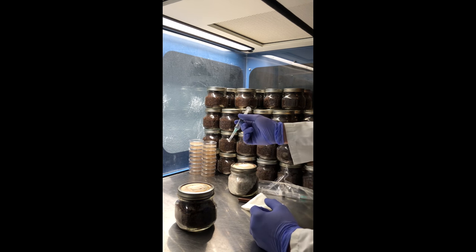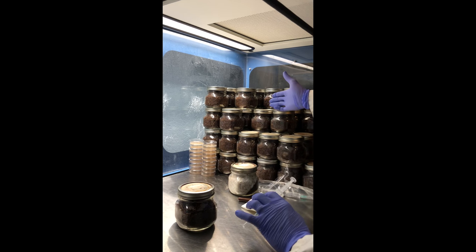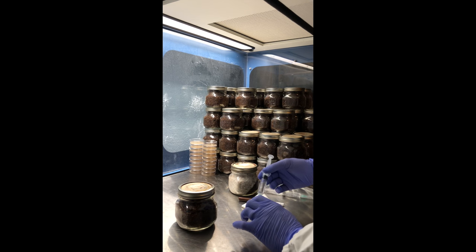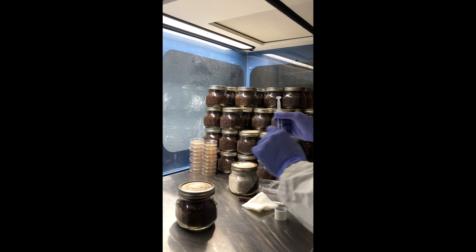We also sell commercial-sized syringes that I used to inoculate about 50 jars, but that would require a little bit more extensive hood or very sterile technique.